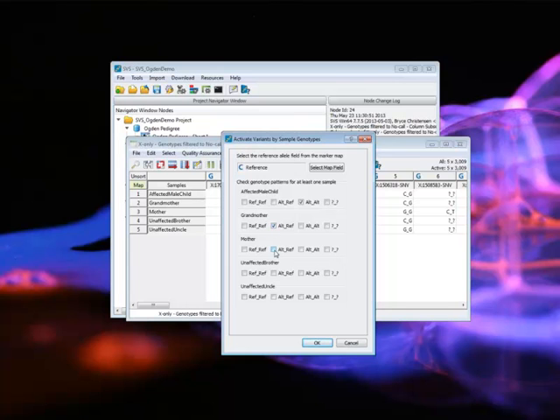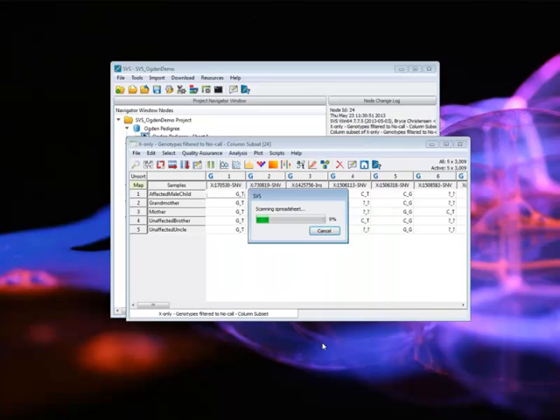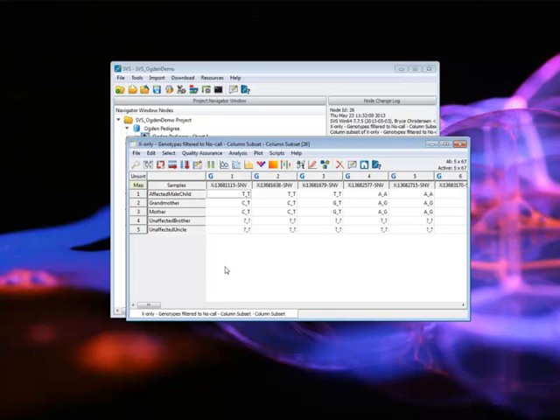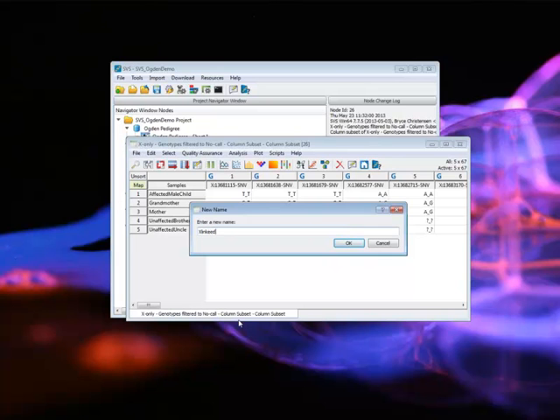We'll get the grandmother and mother to be carriers for the same alternate, while the two unaffected males are non-carriers, but they'll probably be coded as missing if they didn't have a variant column. That's just because of the way the VCF files were processed. In other data sets, they might actually be coded as homozygous reference. So we can see only 67 variants pass that filter, and I can subset to those 67, and rename it one last time. Oops, X-linked.